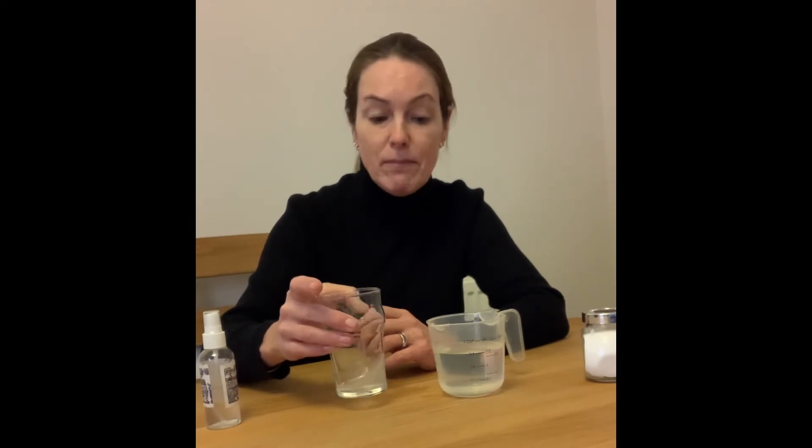Then gently swirl the liquid — you don't want to get soap suds, you're just helping the breakdown of the membranes.